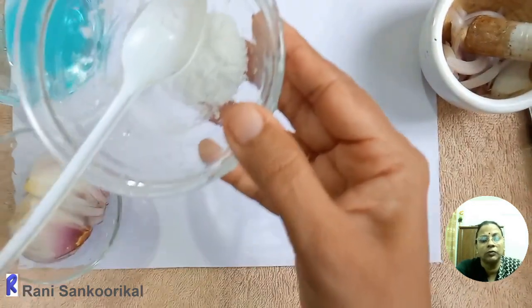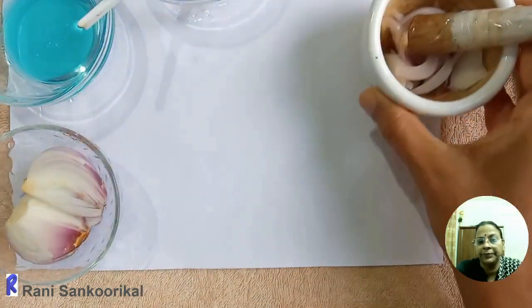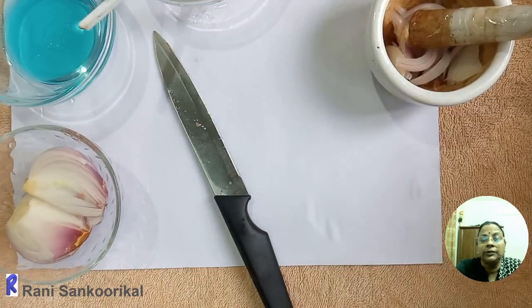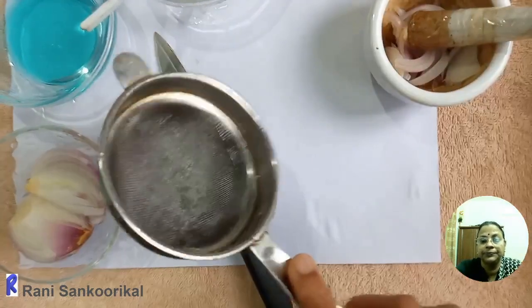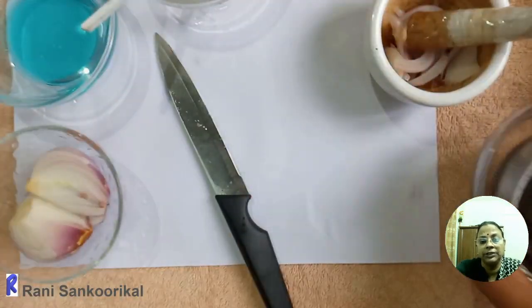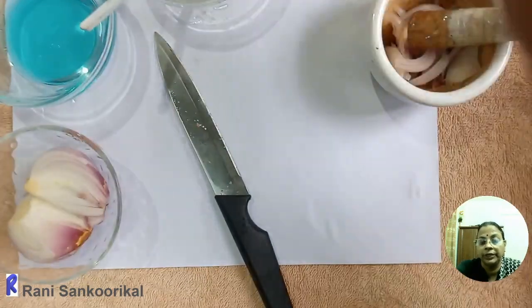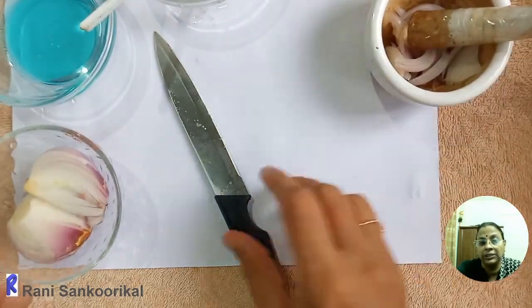Now we will do the demonstration. The materials required: onion, then liquid detergent, which can be any Vim or any dishwash, then sodium chloride or common salt, mortar and pestle, and a knife for chopping the onion. Then chilled ethanol, a strainer, and for straining we need another beaker. The most important is chilled ethanol. It should be very chilled. So these are the main materials we require.